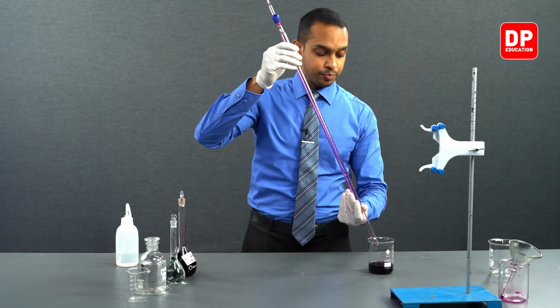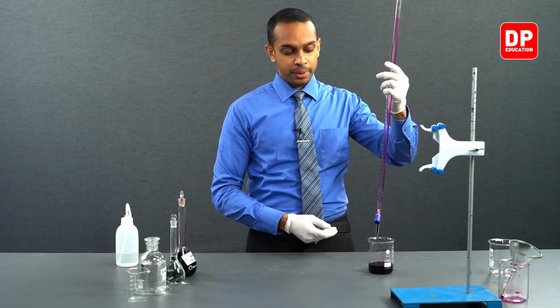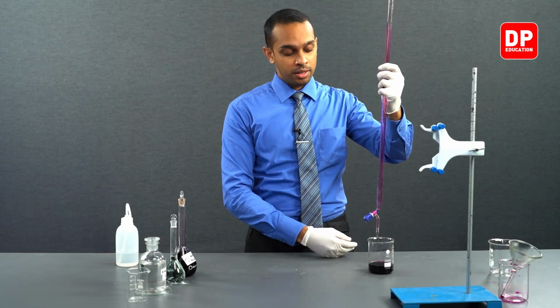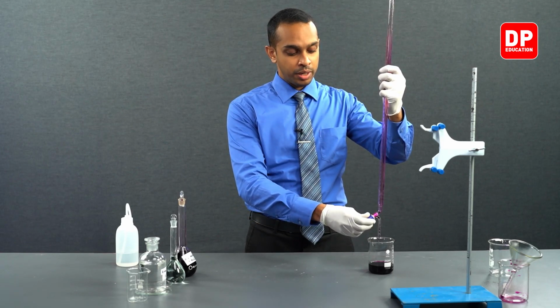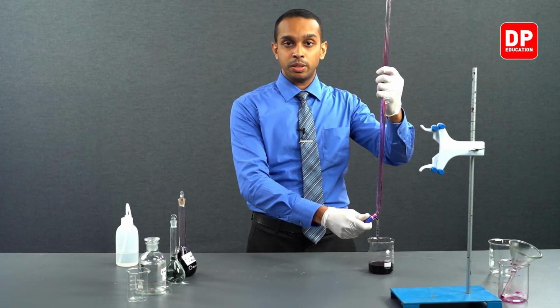With this, the washing of the burette is complete. One additional step would be to open the burette and let the remainder of the solution run through. Now, the burette is completely washed. We can move on to the experiment.